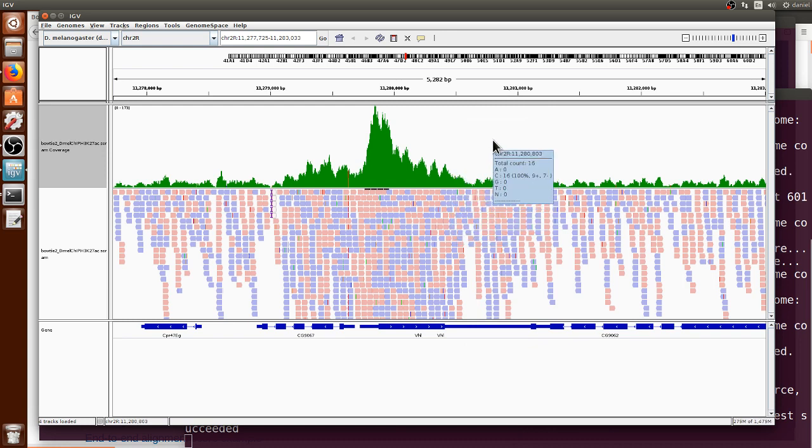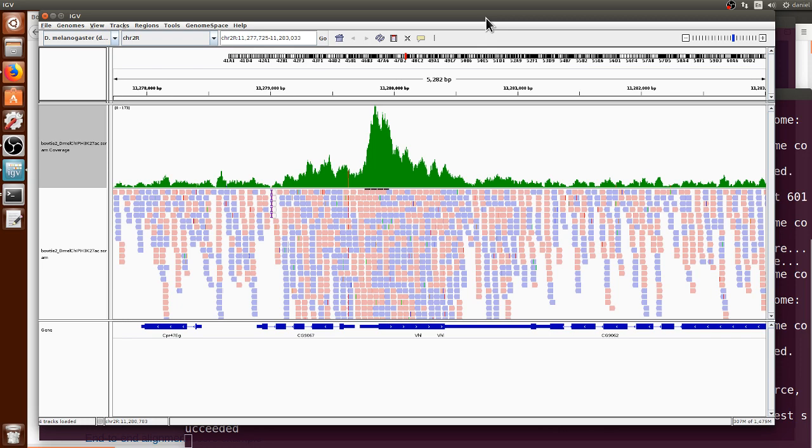This alignment is in Bowtie2 so that's how you run Bowtie2 using the terminal and the computer cluster and some of the samtools too and how you can load them into IGV. I hope you found this video useful.